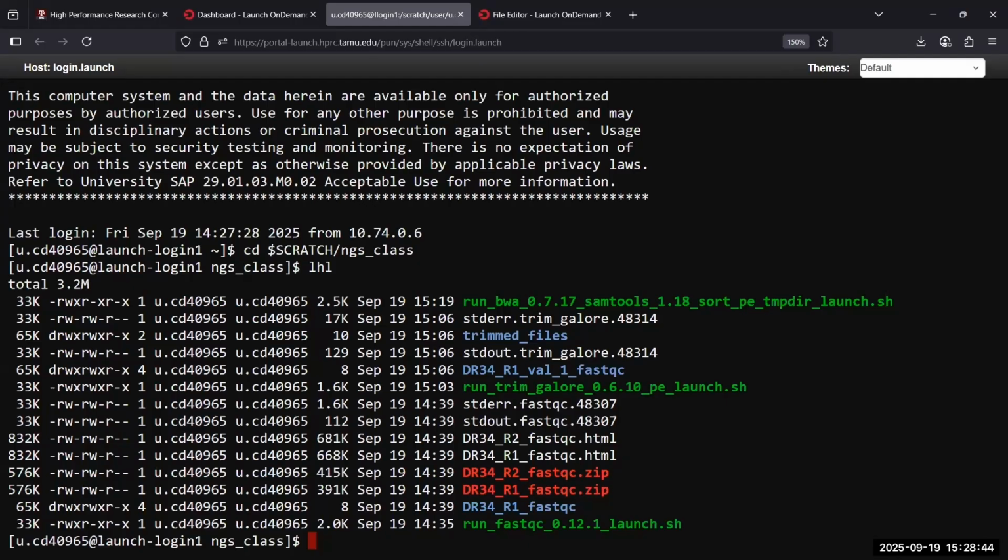Okay, you need a space after this. Use the arrow keys and go back. Enter. And then go all the way back again. So the Unix command is ls. Now you're going to give tab. Hit tab. Okay. And then B for BWA, B, tab. Okay, then capital C. Hit tab. Okay. Hit enter.